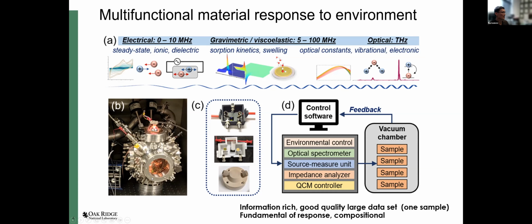And indeed, everything depends on what environments you implement, whether it's liquid environments, gas environment, or vacuum environments.